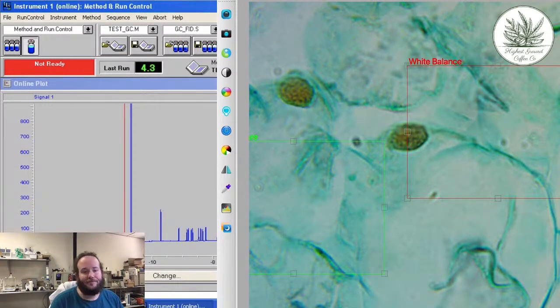You want to test it to know that it's 80%, and then you use that number in your dosing. So, good example, that's like when we do the original Jane, that has THC and that has to be dosed fairly precisely. And so we take a lot of caution when we're dosing around that. But no, so we don't do any of the growing here.